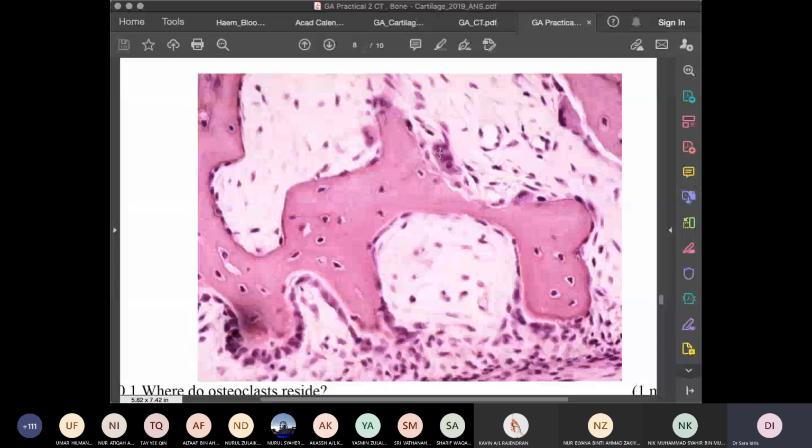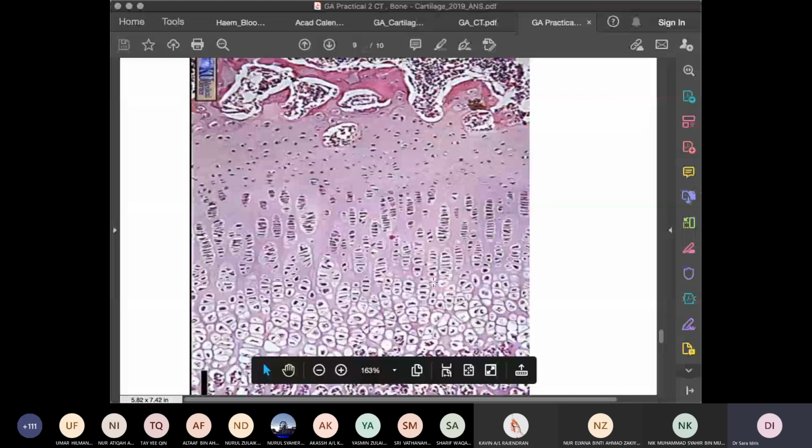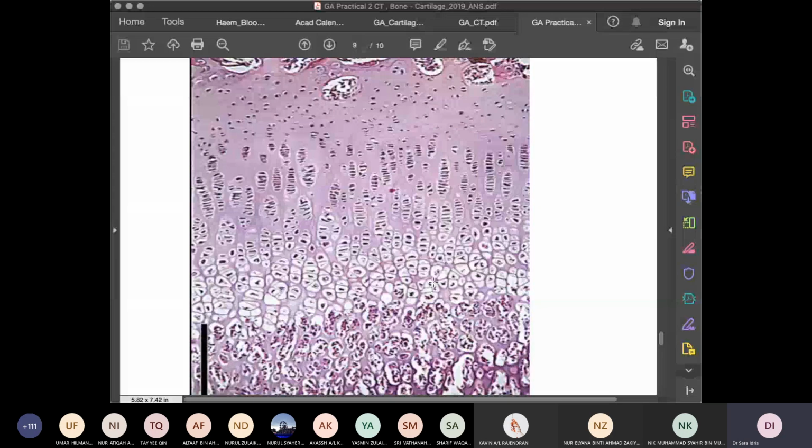All right. Next and lastly will be the epiphyseal plate, and the growth of your epiphyseal plate to become bone. There are going to be 5 zones, going from when the cells, the chondroblasts, are just being chondroblasts, and then they will eventually grow and grow and grow and become bone. The last zone will be the zone of ossification. Ossification means bone.